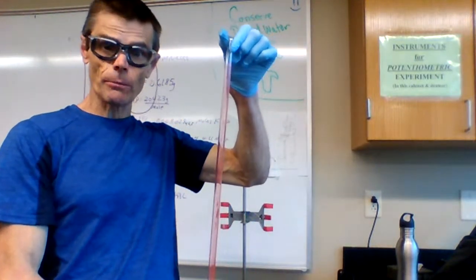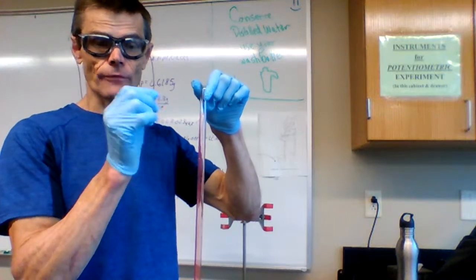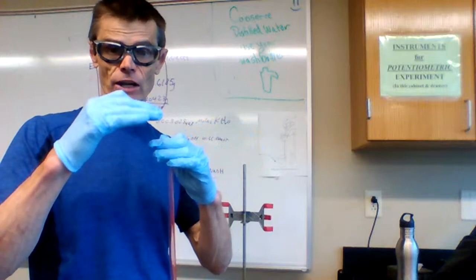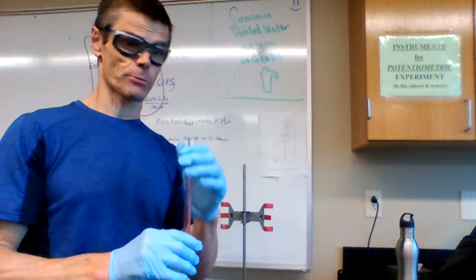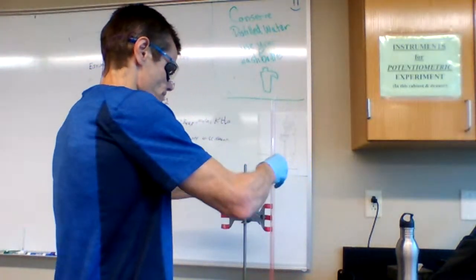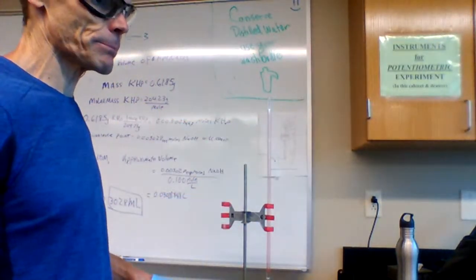And we can estimate, based upon the scale markings, to the nearest 100th milliliter. In other words, if I read this, I can estimate it to 0.01 milliliters. So we're making our estimations to give us 4 digits total, or 2 digits past our decimal, when we make our estimations using the volume in our burette. So what we're going to do is get our burette ready, and we're going to place some of our 0.1 molar sodium hydroxide in the clean burette.